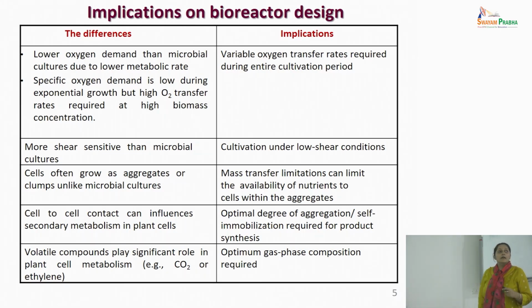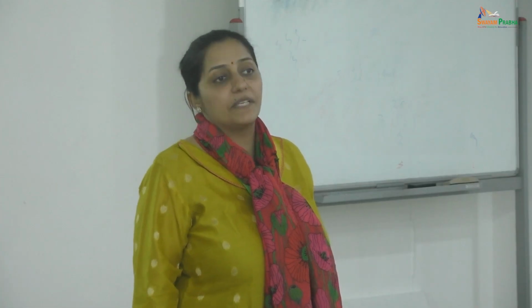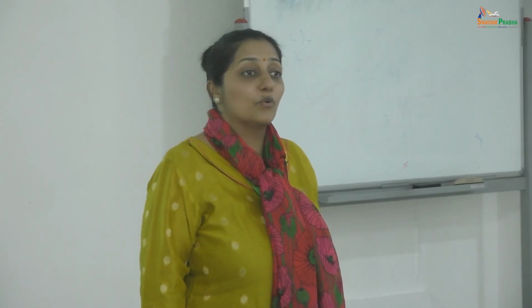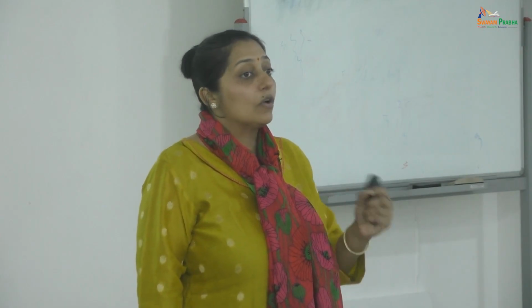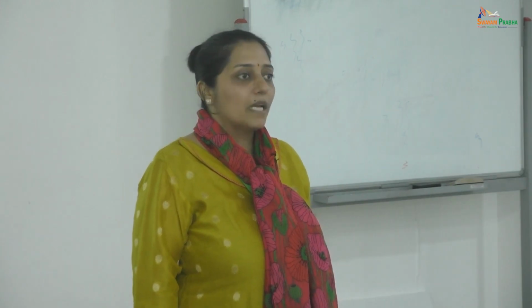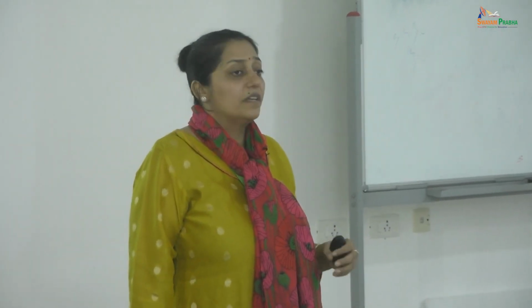What is the threshold shear for my system? You may work with a herb species. You may also work with a tree species. Both will behave differently, and that will also impact the morphology of the in vitro cultures. Sometimes, if you are working with a tree species, you may find they are very slow growing in nature. The in vitro cultures, for example, we were working with Azadirachta indica, neem.